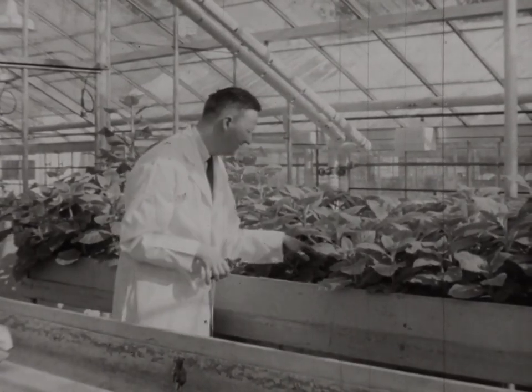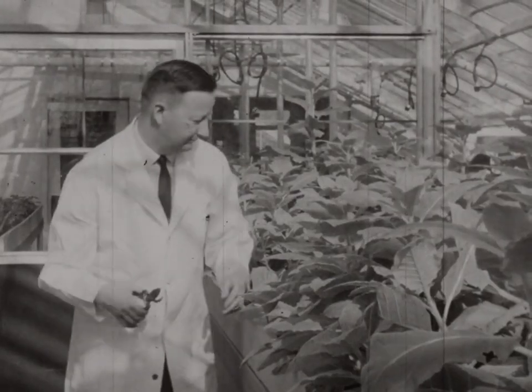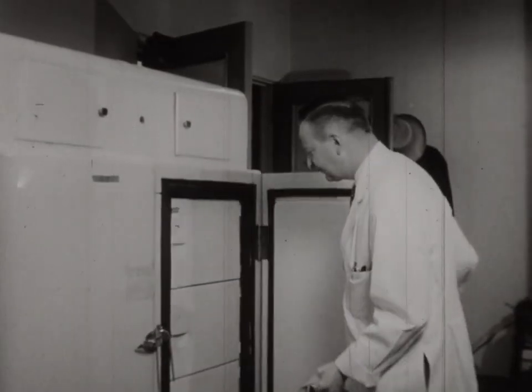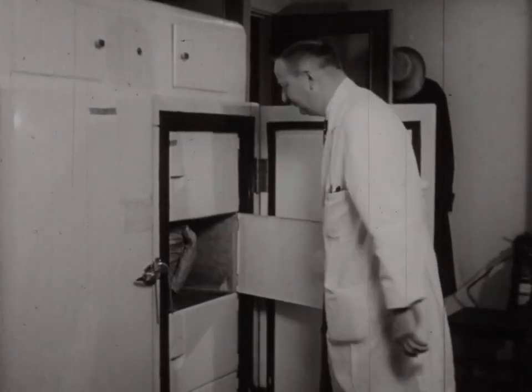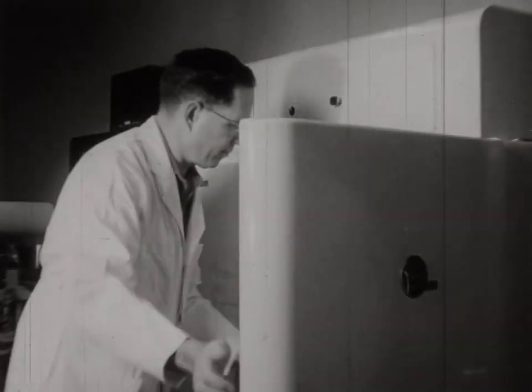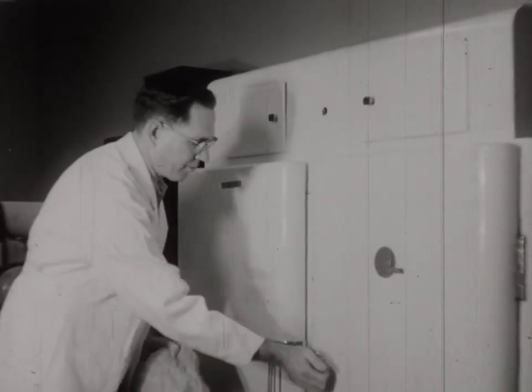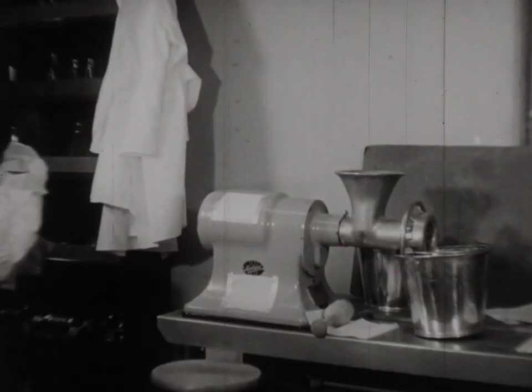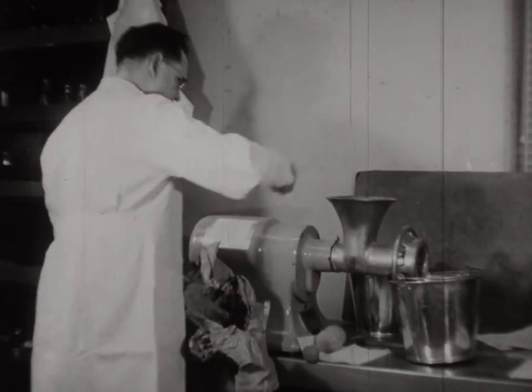Then we're ready to harvest the plants by just clipping them off and putting the leaves and the stems inside a bag. Now we're going to take that bag and freeze the material in it, because the freezing ruptures the cells and makes it easier to get the virus particles out of the broken cell. Then, after the material is frozen, we are ready to start to grind it up. So the leaves are put into a meat grinder, which really makes hamburger out of the tobacco leaves containing the viruses.